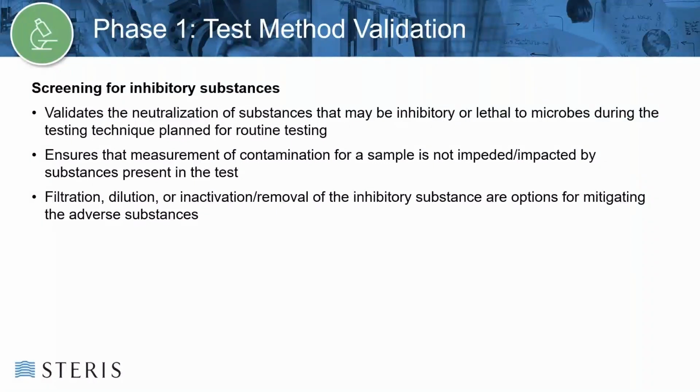Bioburden recovery efficiency testing validates the removal and culturing of organisms from the product and ensures accurate measurement of contamination on or in a sample. There are two methods that we can look under this process: native repetitive method or inoculation method, which is direct inoculation.